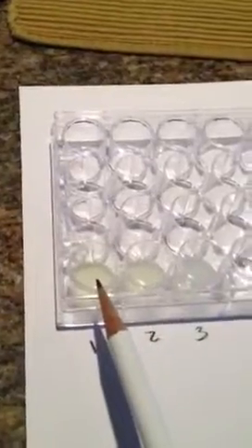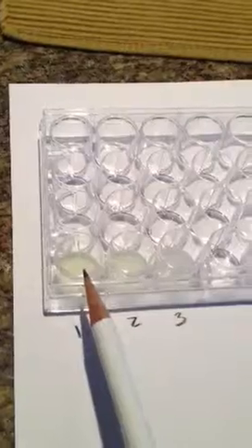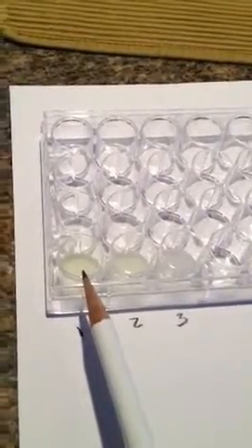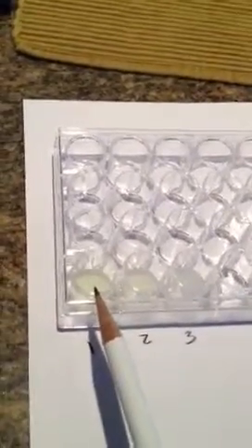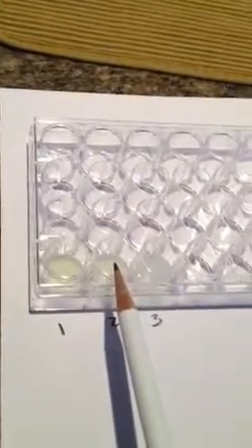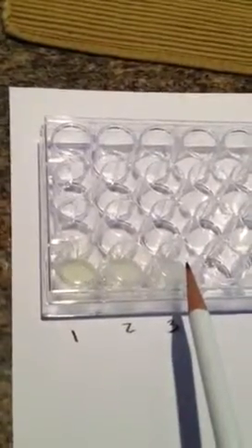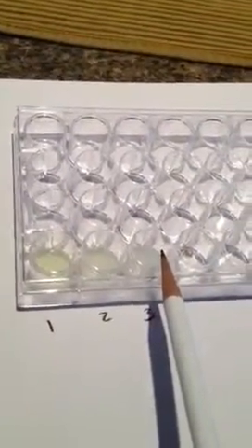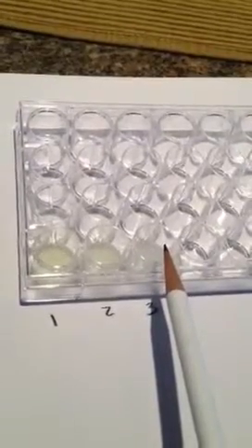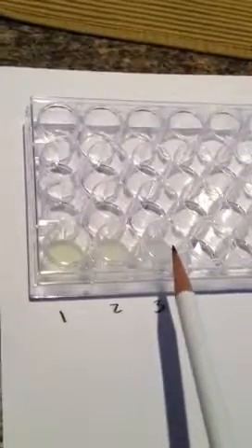In my well 1, I had just the 12 drops of the sodium thiosulfate and then added 8 drops of hydrochloric acid. In well 2, I had 6 drops of water, 6 drops of the sodium thiosulfate, and then 8 drops of hydrochloric acid. And then in well 3, I had 8 drops of the water, 4 drops of the sodium thiosulfate, and then again the 8 drops of hydrochloric acid.